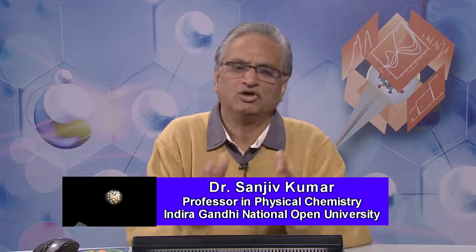People, depending on the requirements, will either go for a xenon lamp, so that it covers the entire range, or they use two different lamps, that is a deuterium lamp for the UV range and the tungsten halogen lamp for the visible range. So, essentially we have to make a balance between the two. Okay. So, that is as regards the radiation sources.